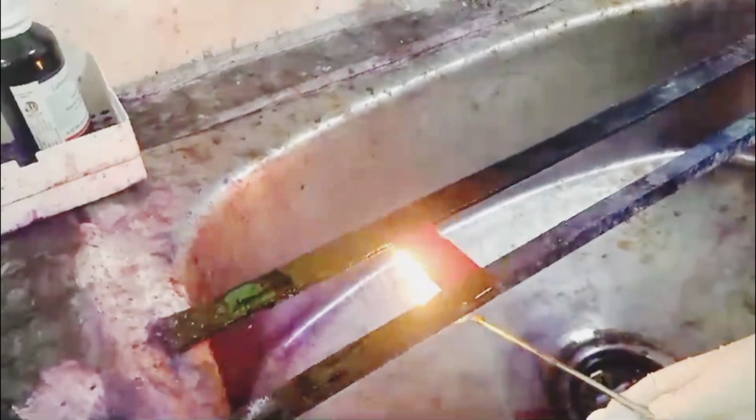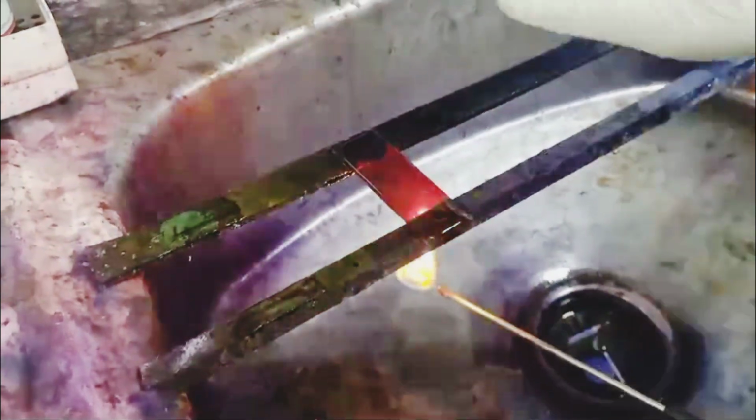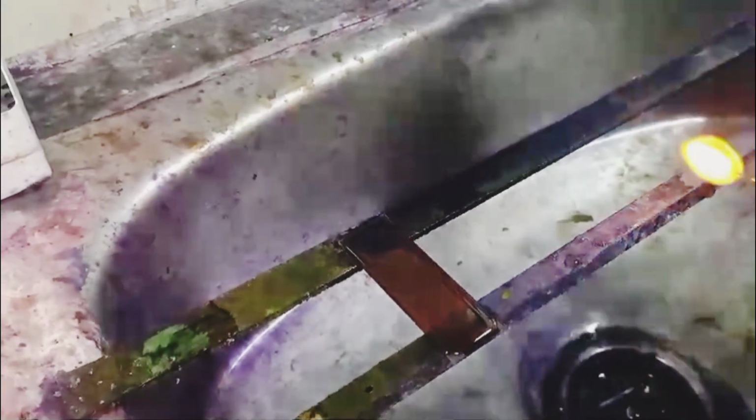Heat the slide and watch. Steam will be produced, and the process will be complete. This is moderate heat for the AFB stain. Look, steam is going to be produced. Let's wait for 10 minutes.